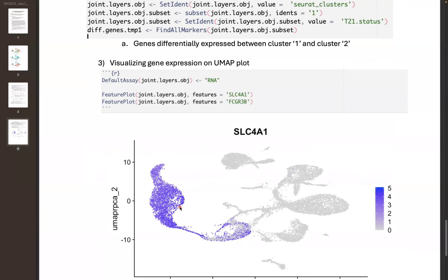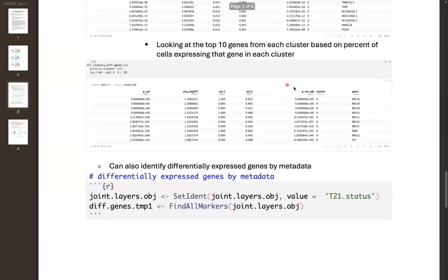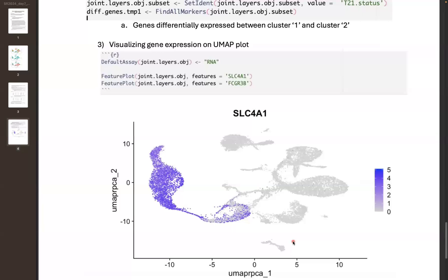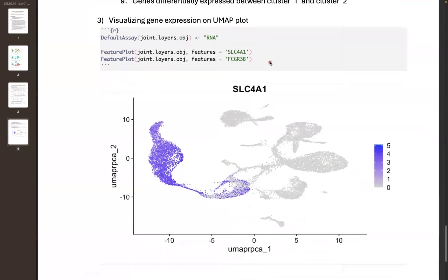We are improving the algorithms that are supposedly able to do cell type identification automatically, and moving forward these will probably become more popular and effective. But a lot of times it requires pre-existing knowledge of what cell types to expect and a reference file — which for different tissues and organisms you might not have. I'll stop there and let you play around. After you get through this worksheet, you can play around with plotting different genes, observing how they look when expressed across different cell clusters, and then we'll go through how to do this more automatically.